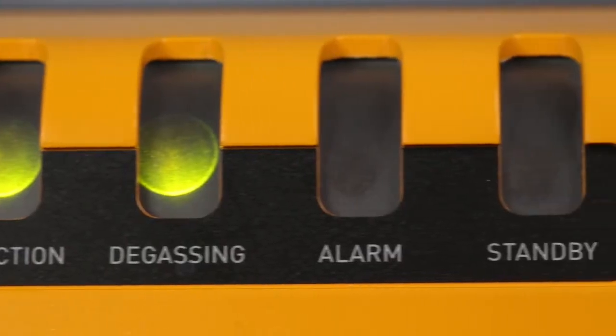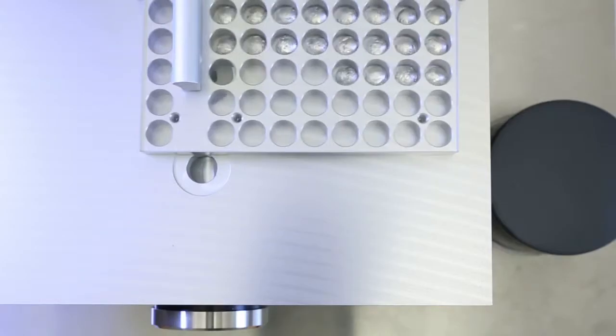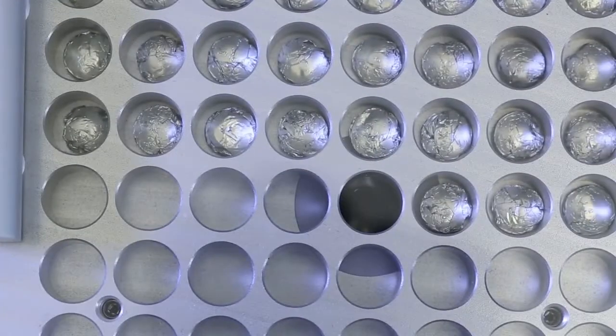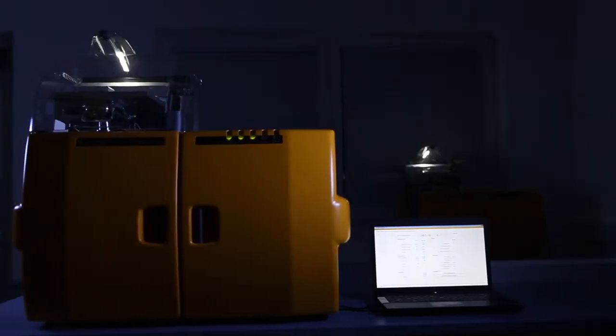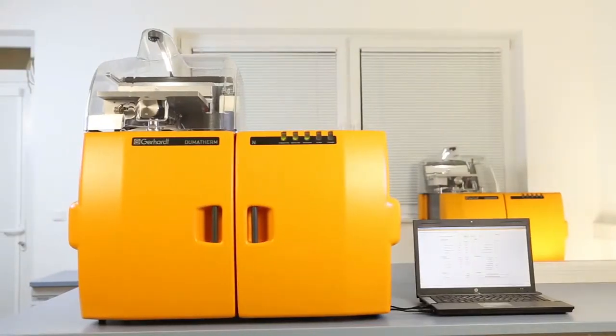Three minutes and your protein analysis is complete. Fully automated, software controlled, and continuously monitored. Dumatham, the next generation.